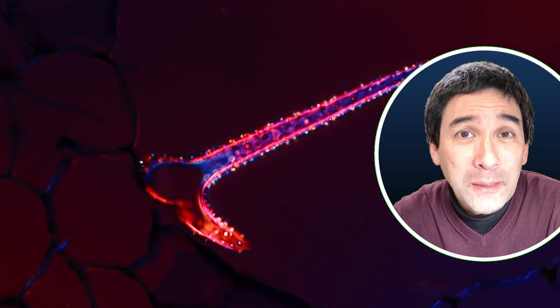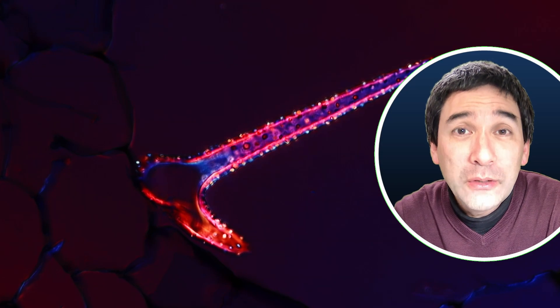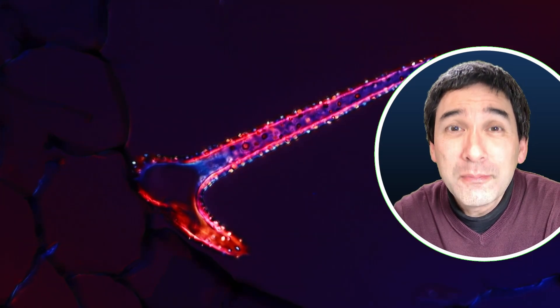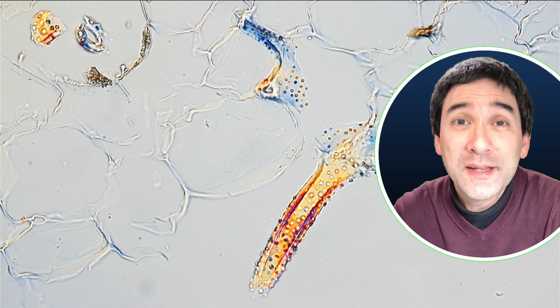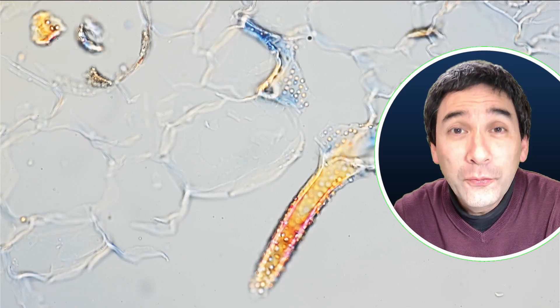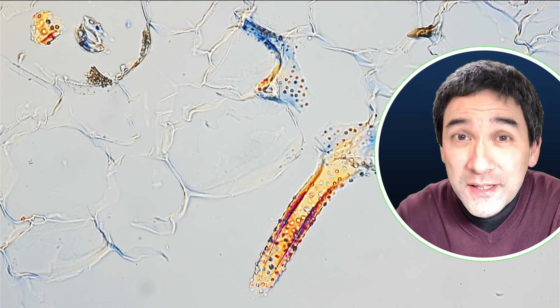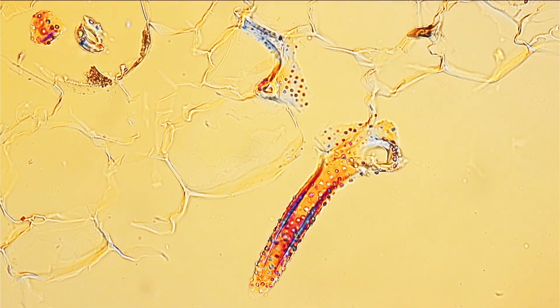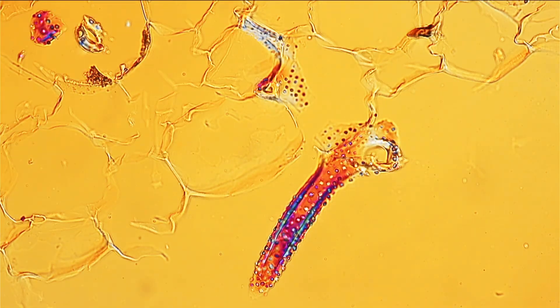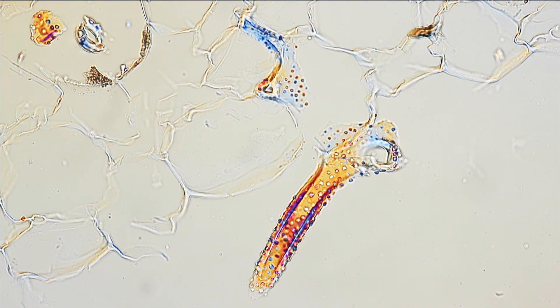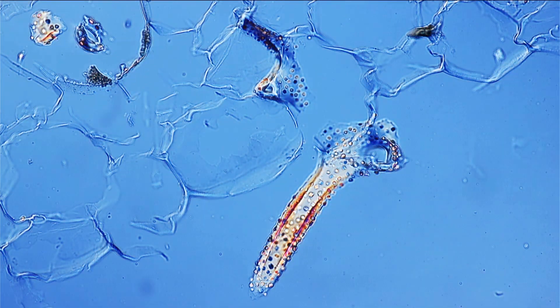Those idioblasts that you can see here are not only found in water lilies, but can be found in a large variety of other plants as well. Often those crystals can have different shapes, so-called raphides. These are crystals that are very spike-like and needle-shaped in structure. So the way that crystals look can be very diverse in nature.